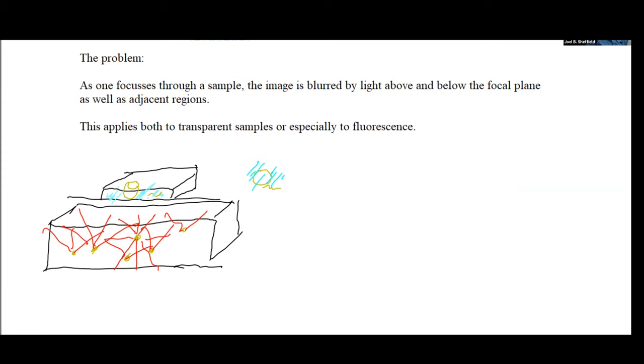So if you set your microscope so that you focus only on this one spot, then the spot will be in focus, but all the rest of it will be blurred. So you'll end up with, again, something sort of like this. You'd have this spot, but again, it will be blurred out by all the material around it.